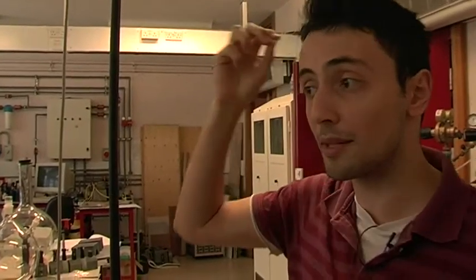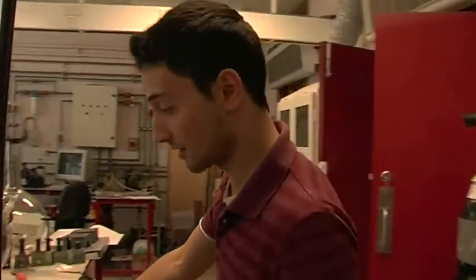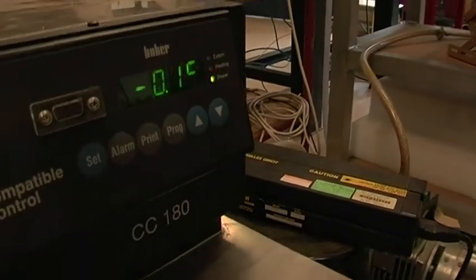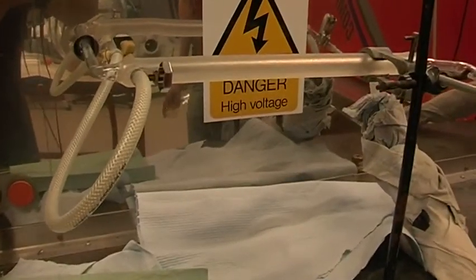To simulate atmospheric conditions more accurately, the reaction cell is both temperature and pressure controlled. Atmospheric temperatures are much lower than ground level temperatures — it's much colder up there and pressures are lower as well. We use a thermostat unit to control the temperature, and as you can see, it's set at about zero degrees Celsius. You can see some condensation forming on the glassware. So we're simulating atmospheric conditions — that's as close as we get to what's really going on in the atmosphere.